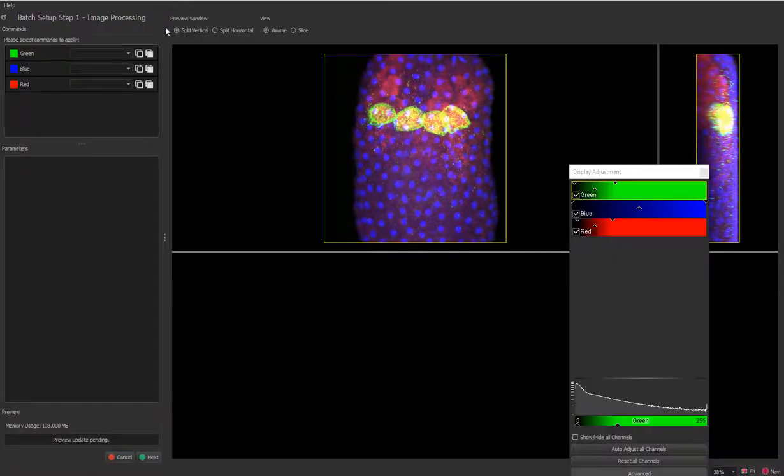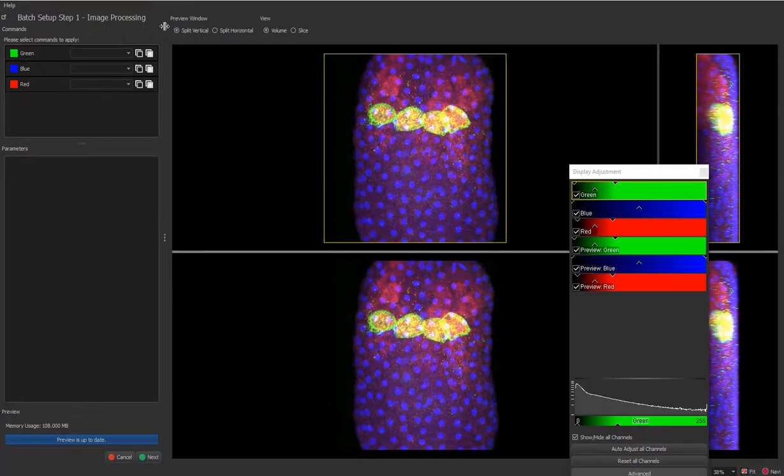Batch Pipeline Creator consists of two major steps: Batch Setup Step 1, image processing and Batch Setup Step 2, objects.